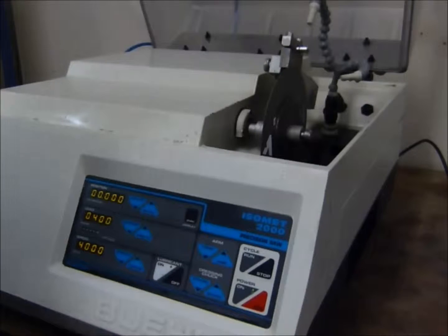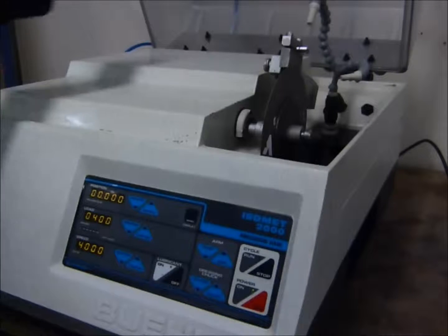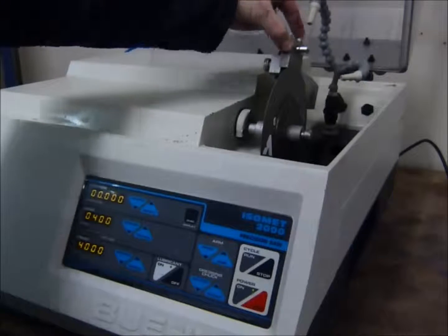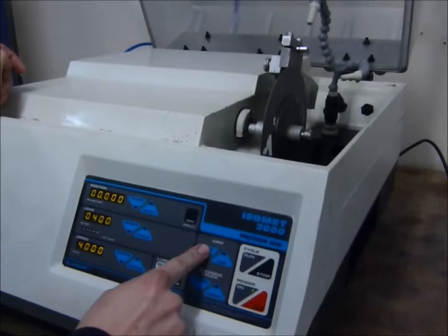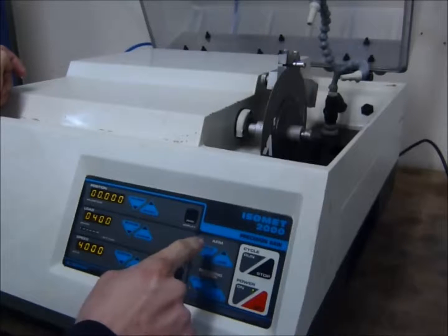This is a quick video on how to use the Isomet 2000. Once you've placed your sample in the clamp and tightened securely, you can lower the arm down just by pushing the lower button. Just bring that just before it touches the blade.